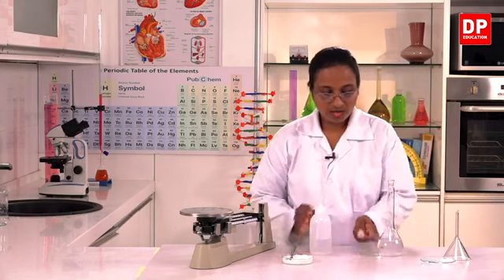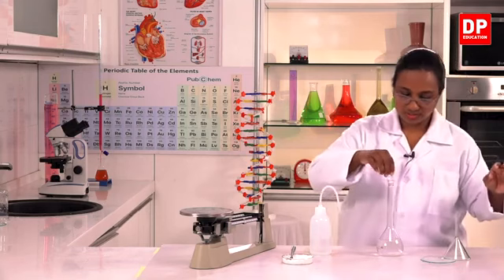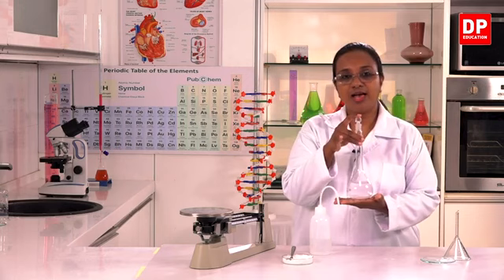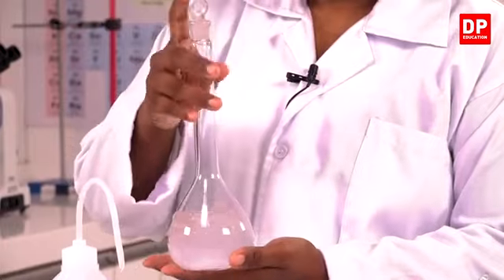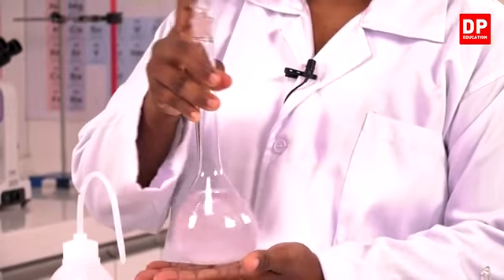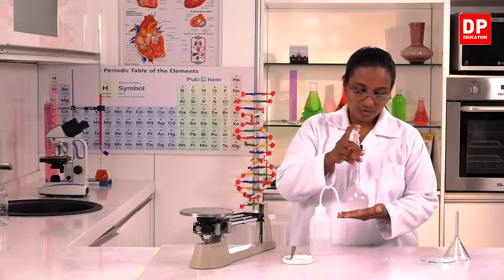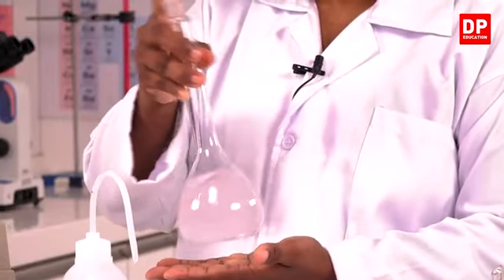Okay. Now I close the lid again just to make sure it's clean. We hold the volumetric flask in this manner. Always you have to have a hand under the volumetric flask, and by swirling it, we can dissolve the solute. It has to be a swirling motion so that the solute dissolves completely. We shouldn't turn it upside down.